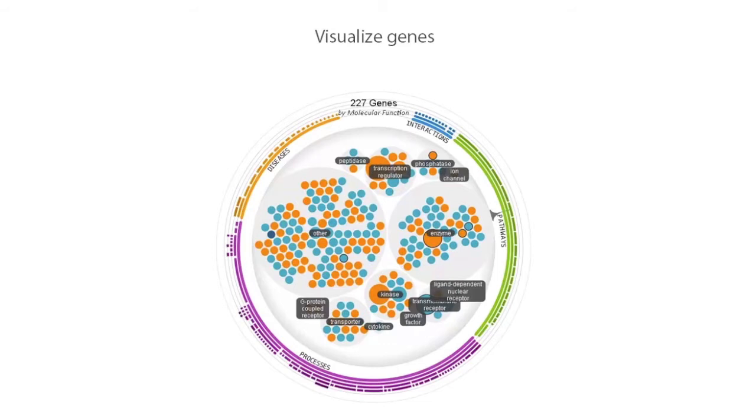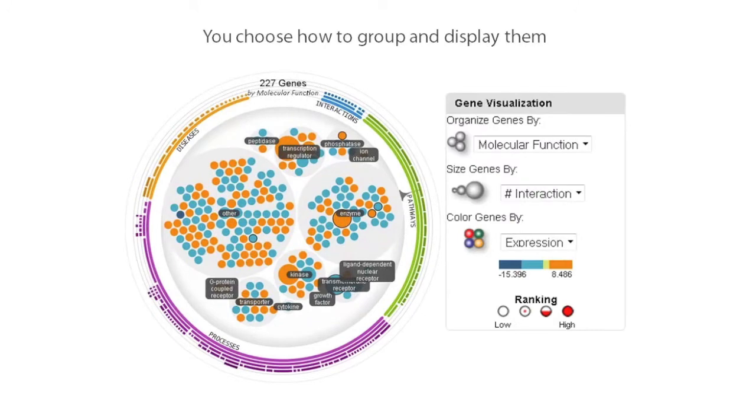Here also, genes are grouped by function, so genes relating to a similar biological function are in a single gray bubble. The size of the gene can represent the number of interactions it has with other genes in your dataset. Most importantly, you can change these groupings as you like to better explore the biology you're most interested in.